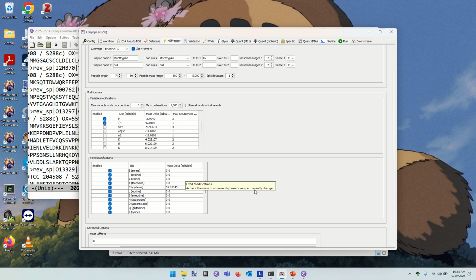This is coming from reduction and alkylation of disulfide bonds. So we reduce the disulfide bonds with DTT, yes, most typically, and then we would treat them with iodoacetamide. Iodoacetamide or chloroacetamide, either way, would lead to a mass shift of 57 on cysteines. And that reaction runs almost perfectly to completion. So we would expect all cysteines to be modified in this way.